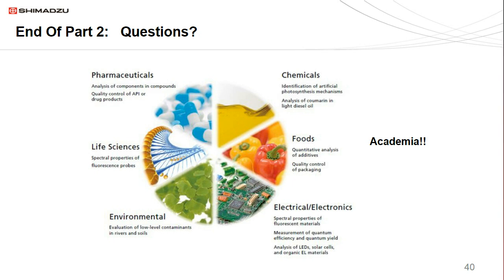Almost a trick question. They are two techniques that measure the same thing but can provide you with different information. So I'd be hard-pressed to say one is better than the other. They are actually complementary techniques, and most people doing mixture analysis would probably use both. Synchronous scanning gives you more definitive information in that it's a single scan and it's easy to analyze. For example, we showed you how you could quantitate the area under it.